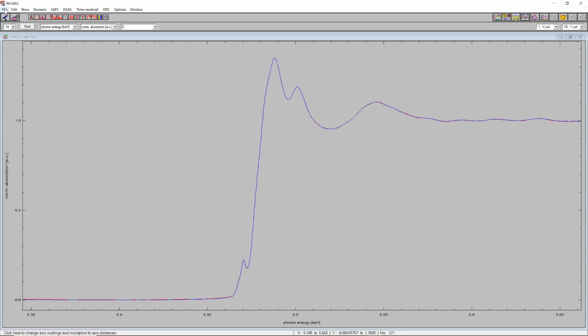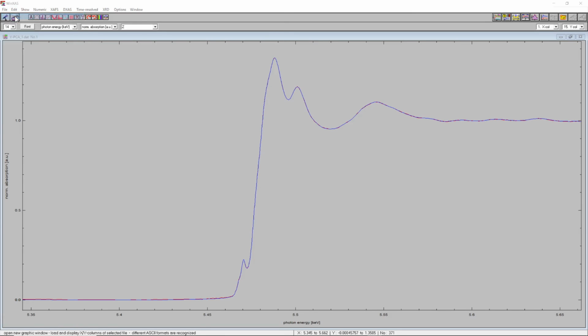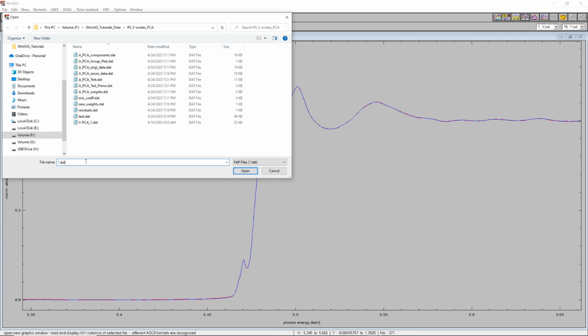The concentration, the output of this batch analysis, of this automatic analysis, is saved in a separate file, which is called autodex parameter. Automatic analysis, the parameters.